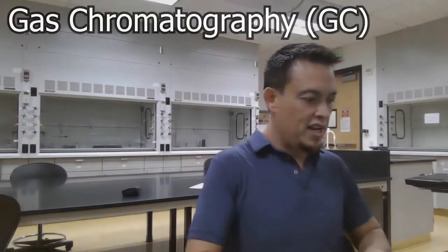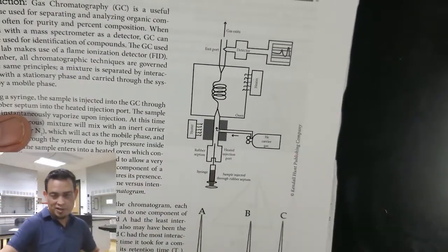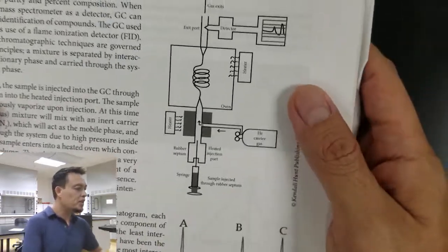I want to go ahead and start off by talking about the gas chromatography instrument. This is, like I said, a GC, or a chromatography technique. We use the inert gas as our mobile phase, and we have a silica gel column as our stationary phase. In the manual here, I do have a schematic of the instrument. We'll see the actual instrument itself too in a little bit.